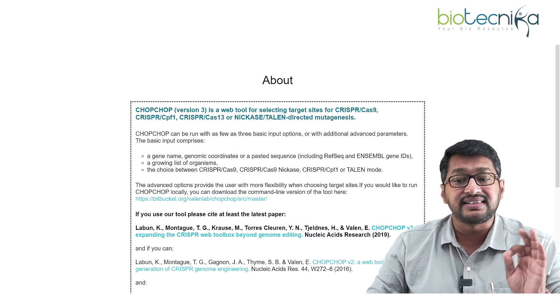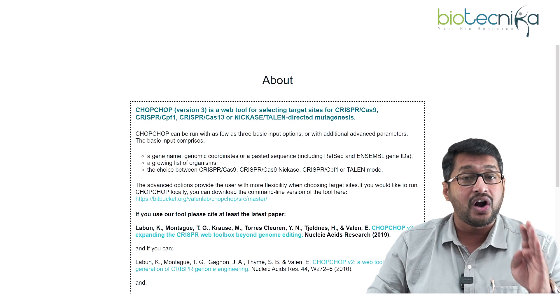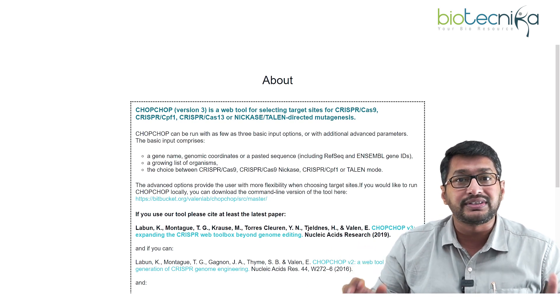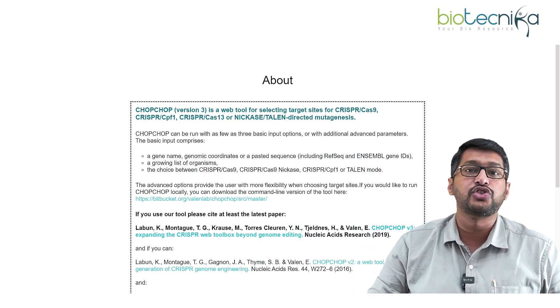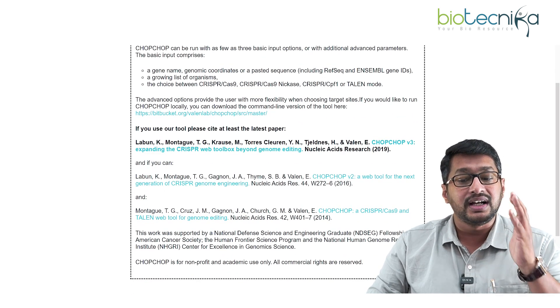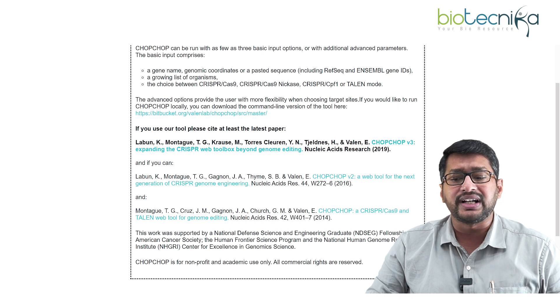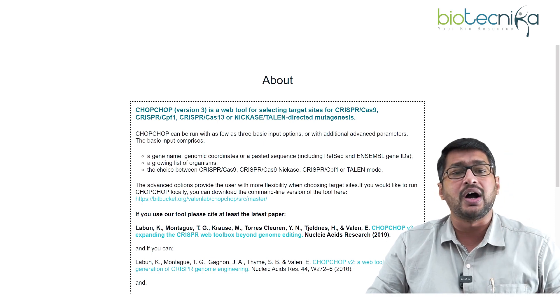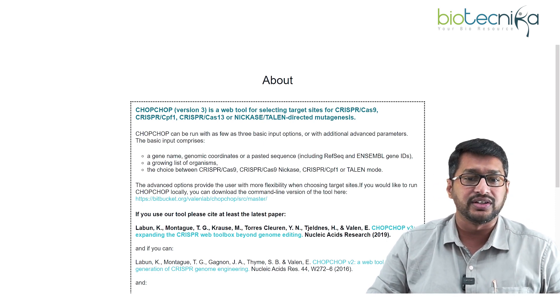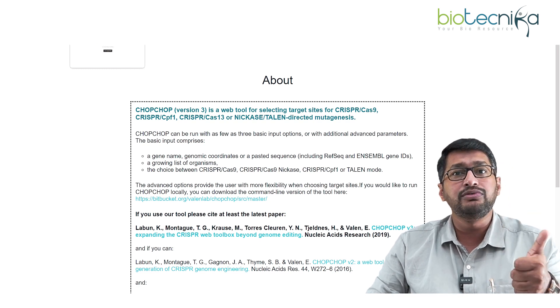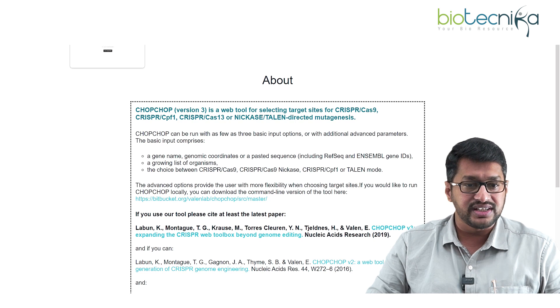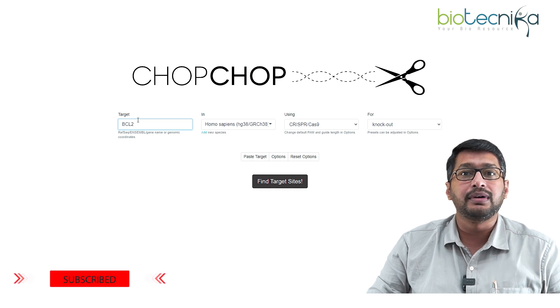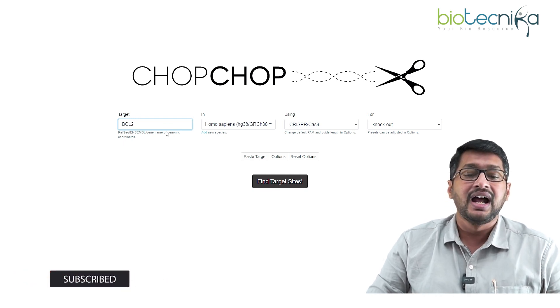CHOP CHOP is currently version 3 and is a web-based tool helpful for selecting target sites for CRISPR-Cas9 technology, as well as various other CRISPR variants. The details are published in Nucleic Acids Research by the tool's designers. Now, since I've decided to use BCL2, I'll type it into the target field in CHOP CHOP.